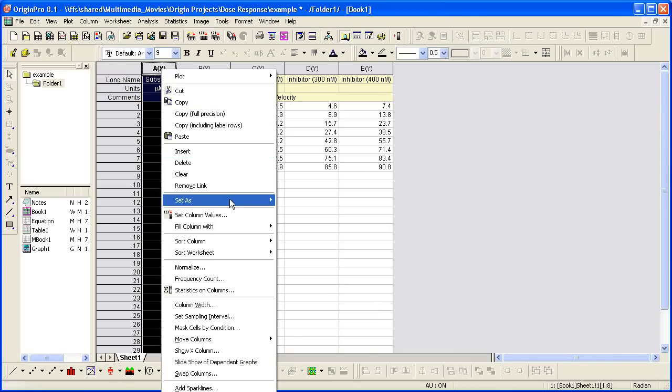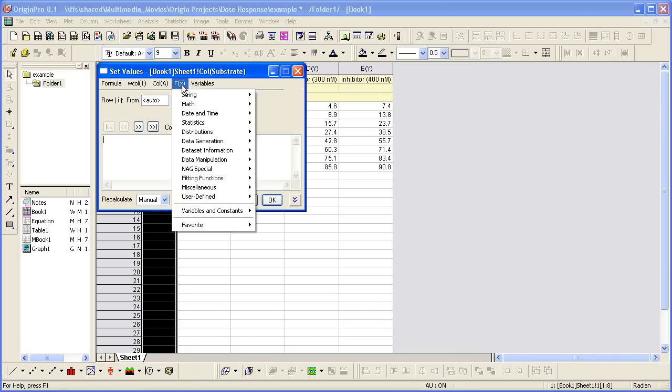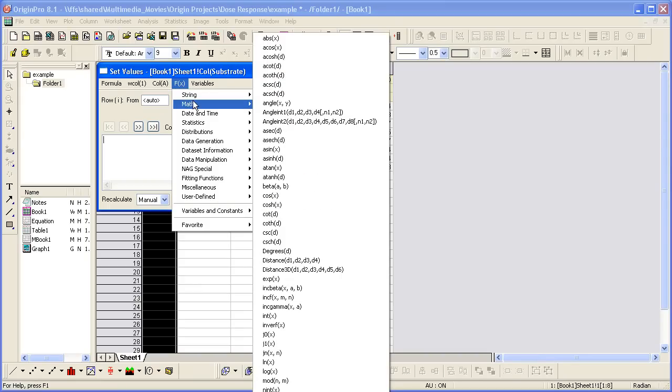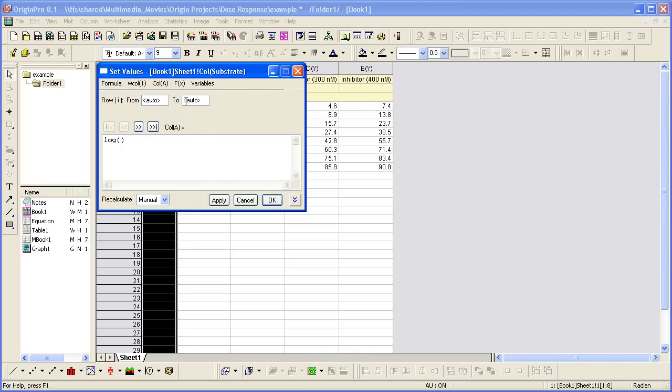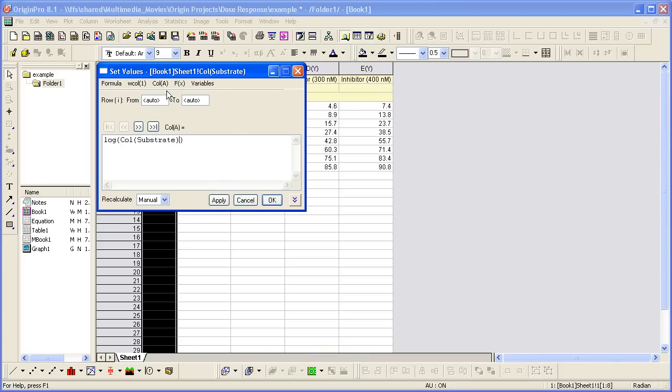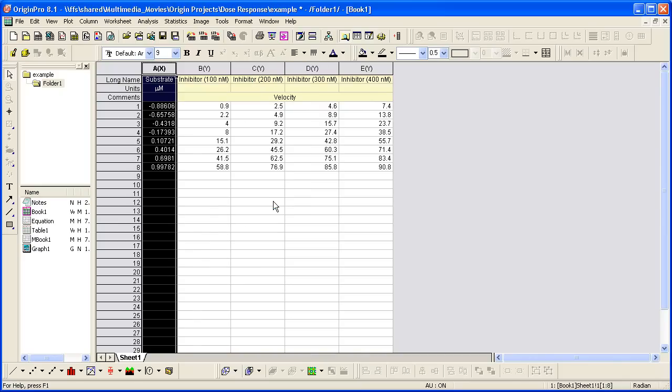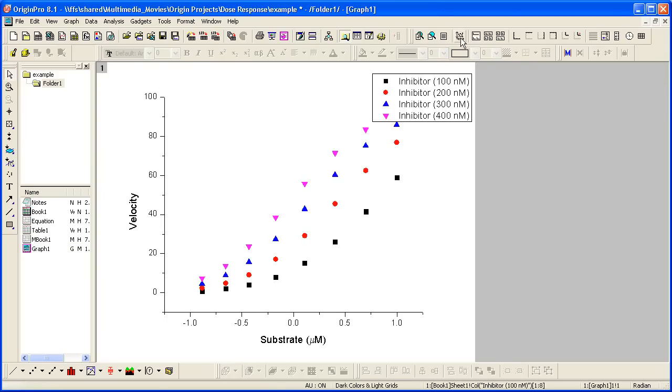Right-click and use set column values. And then what we want to do is take the log of the substrate column. Go back to our graph, which will update. We just need to rescale the axes.